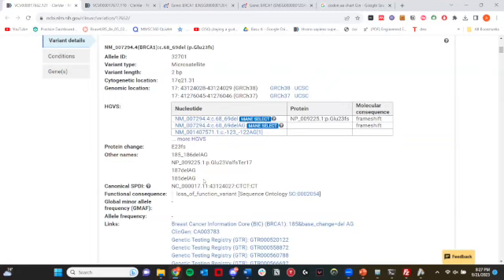But in another isoform, it's cDNA. Can you highlight the c.68_69? Yep. Yeah, there. At the cDNA level, positions 68 and 69, so definitely the starting position is different.